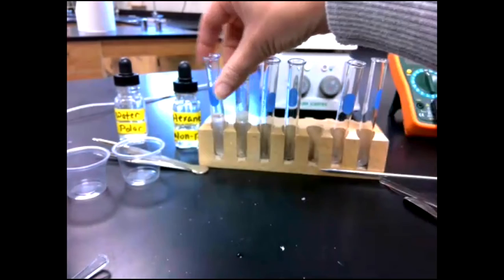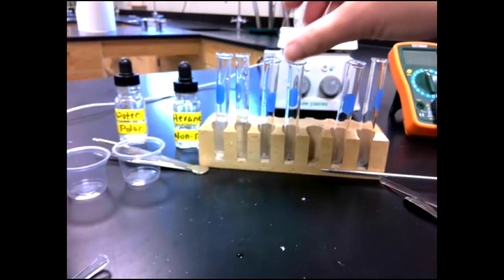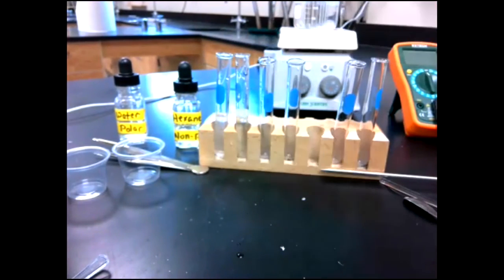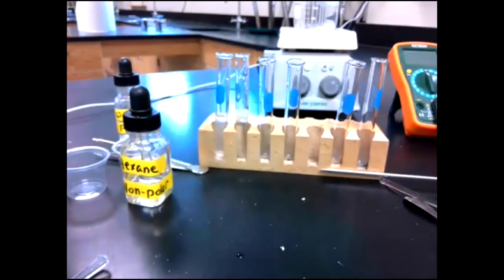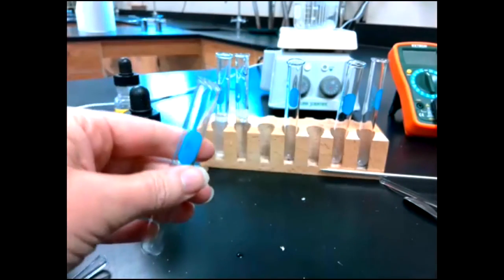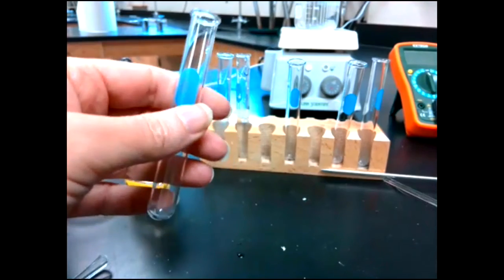And use some of them later. So I'm going to leave that here. I'm not going to dump them out. And then I'm going to do A and B in hexane, which is our nonpolar solvent. So again, put A in the first one.